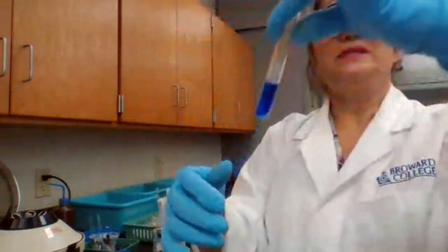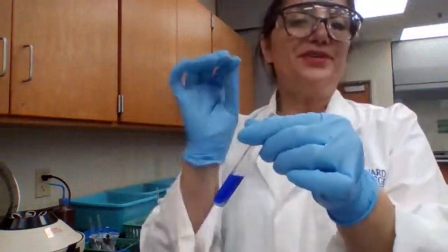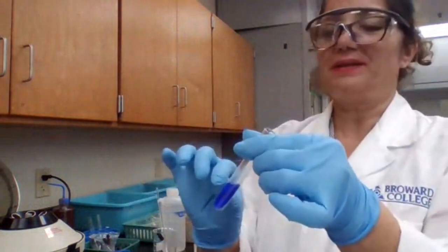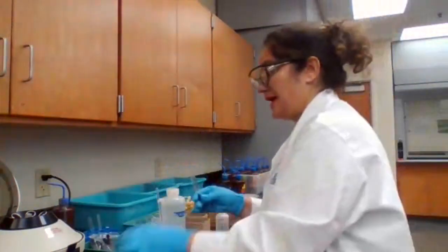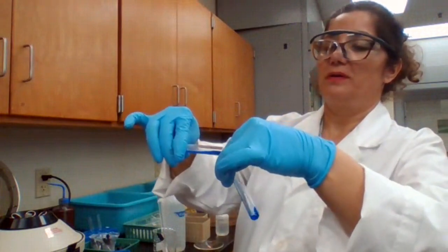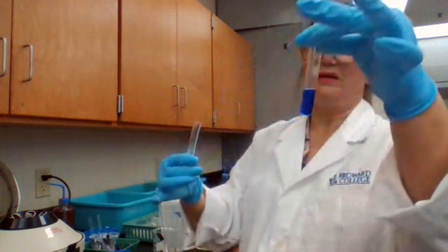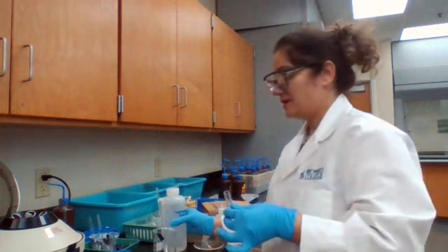Okay, nice deep blue color. That means most likely, 90%, you have copper, but we are not sure yet. So we're going to separate it based on the procedure. We have to separate the liquid and save it for later to prove that we have copper. If for your unknown you get a color like this, most likely you have copper, but we're saving it to confirm later.